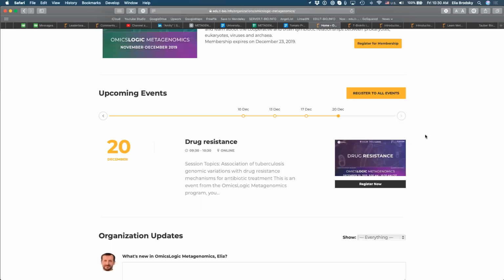And so we'll look at an example study with new data that is being collected recently, and we'll look at how to analyze that data and what types of analysis methods can help us spot and characterize this drug resistance, so understand it also on the biological level. So these are some exciting projects that we'll be covering in the whole program.